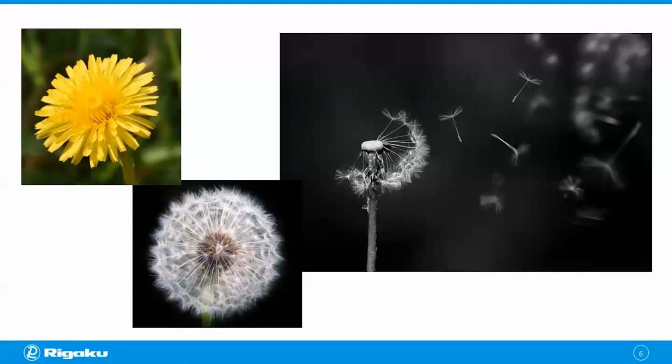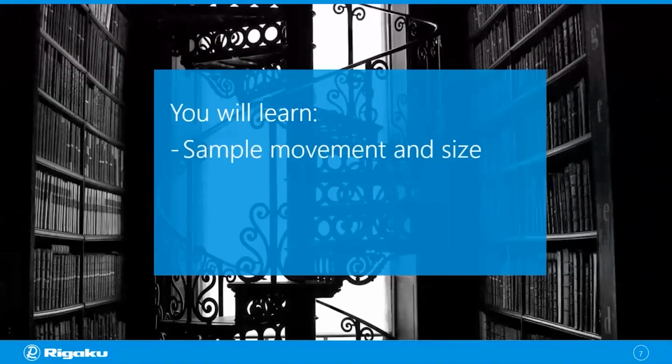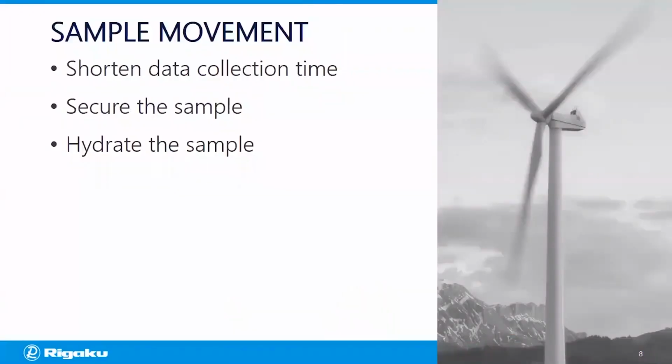For this webinar, we'll review considerations when performing CT experiments with plants. And in particular, we'll talk about sample movement and size considerations. We'll talk about instrument optimization. And then finally, we'll look at some applications of X-ray imaging with respect to plants.